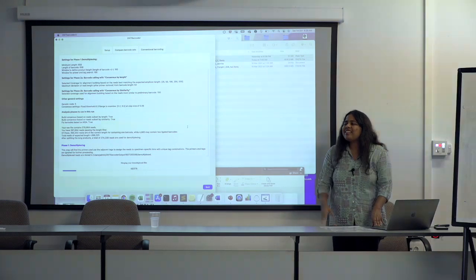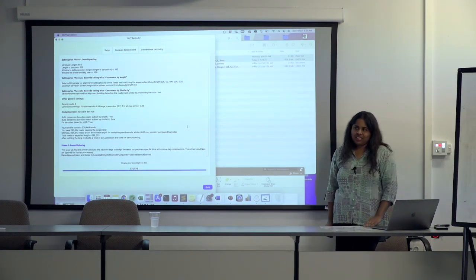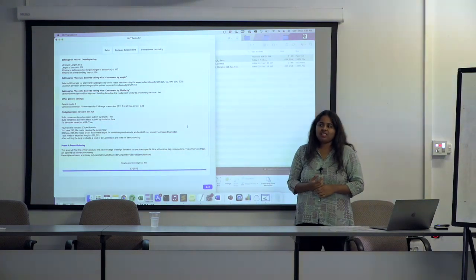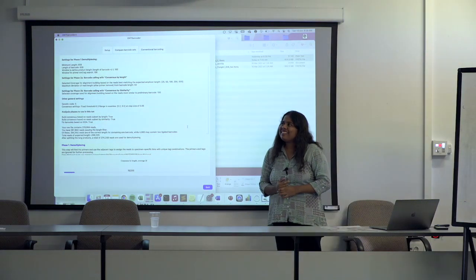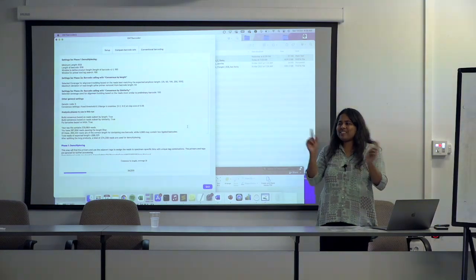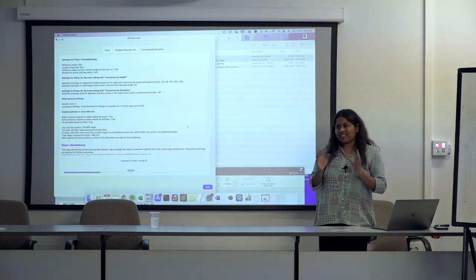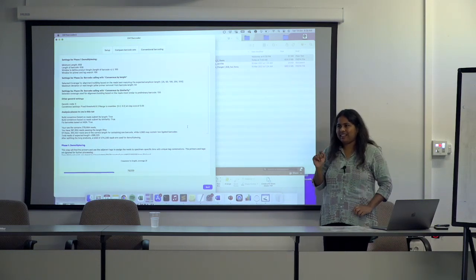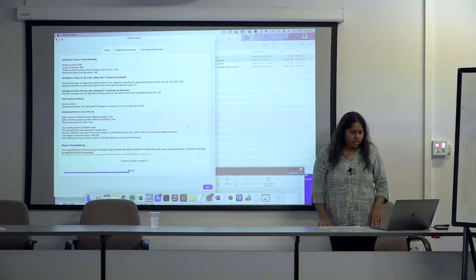Yeah, that's right. I think it's the Mac. The Mac does perform a little faster. Maybe it's just a Windows thing, but I find that it always pauses for a while at 72,004. Is there something in the software that says when it gets there, take a break, and then come back again? I think it is recalibrating the processors at that time. It is parallelized, and Windows has that issue. Some of the older computers especially are not so great at handling it. If you have an SSD, it tends to work better.